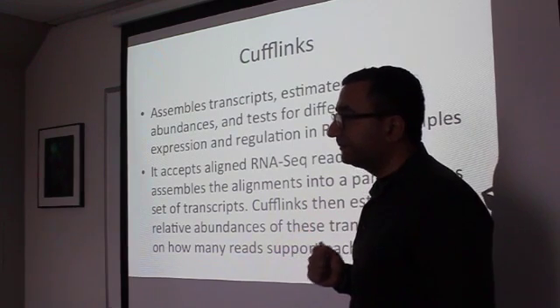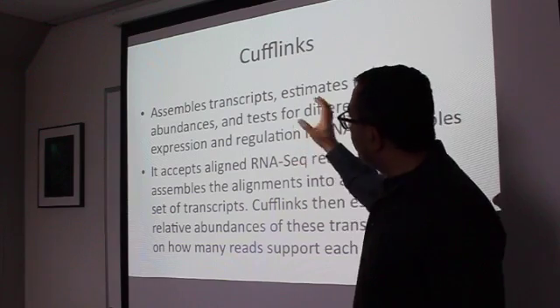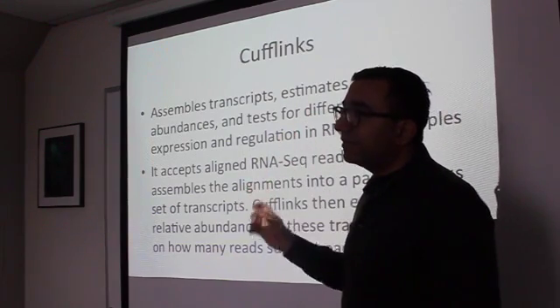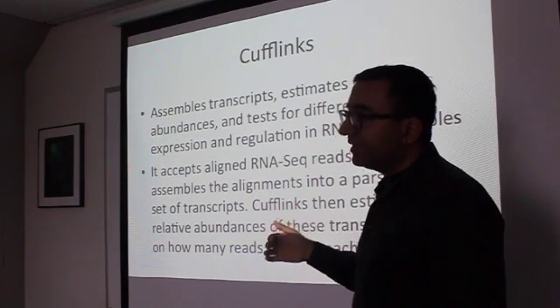Does it do normalization, total number of reads per sample? Yeah, so the Cuffdiff, that's already in there. Cufflinks, and then the program that does that is called Cuffdiff, for differential expression. So it does the normalization and gives you the differentially expressed genes.